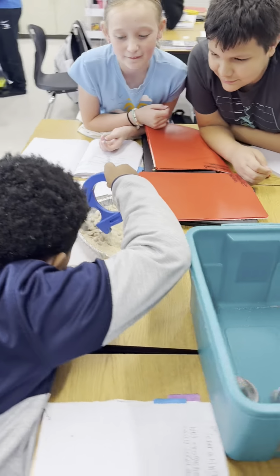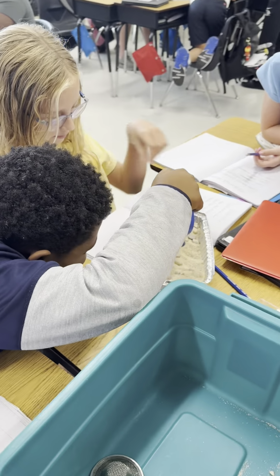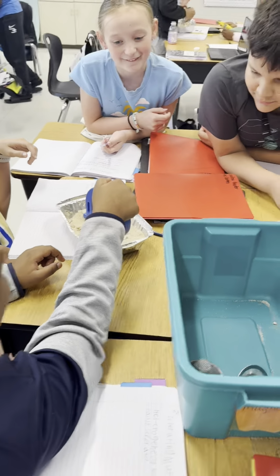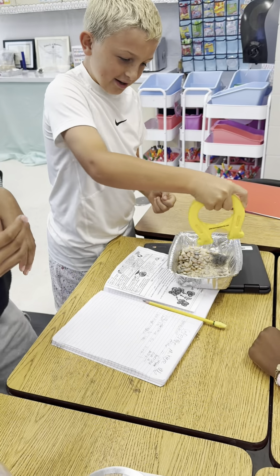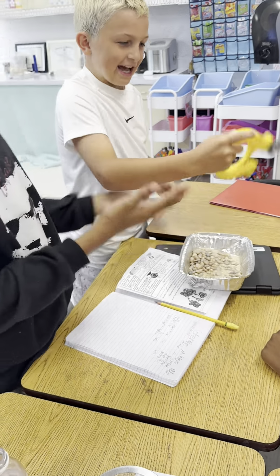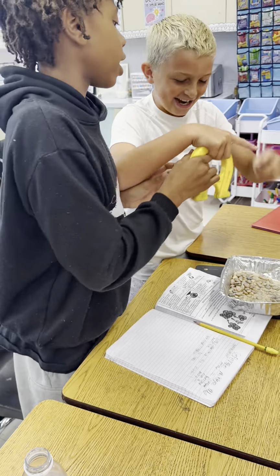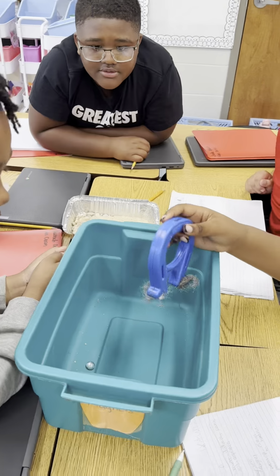It's attracted to the magnet. Bro, why would it? The sand is literally blocking it. Cover it over. And then it picks up the magnets. Because this is magnetic. Okay, here, let me tell them. You break it.